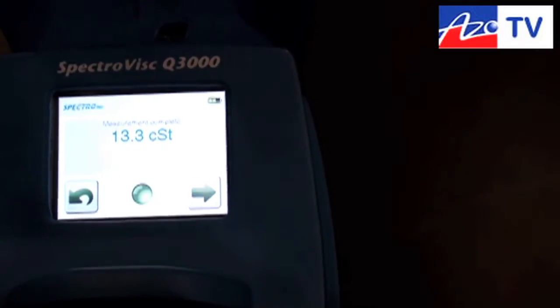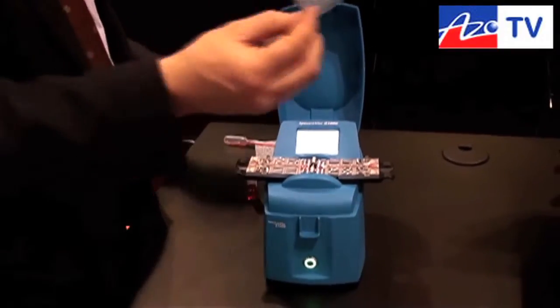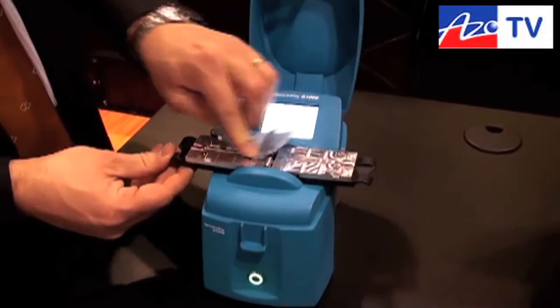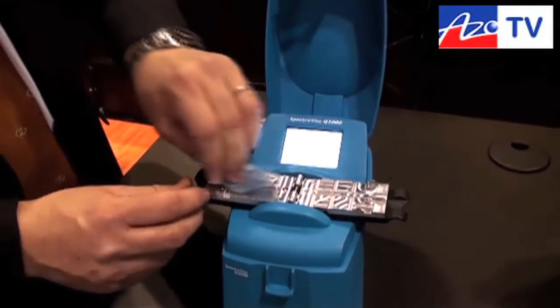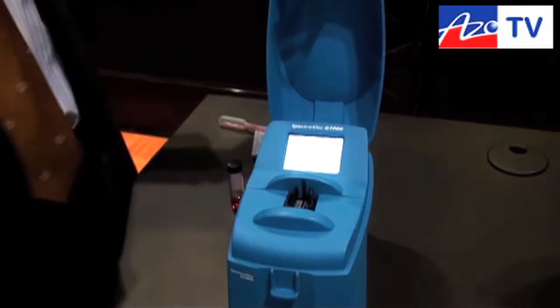Straight away, here's the result: 13.3 centistokes at 40 degrees C, heated. The green light indicates there were no air bubbles in that sample. Hey presto, we're ready to go. The system is very easy to use. And here's a great feature — because you only use three or four drops, you simply wipe it clean and you're ready to go for the next sample.